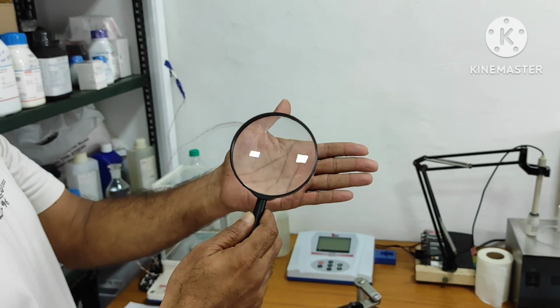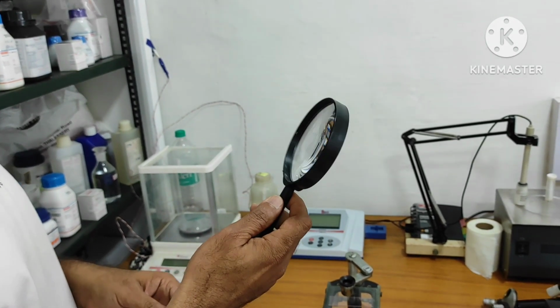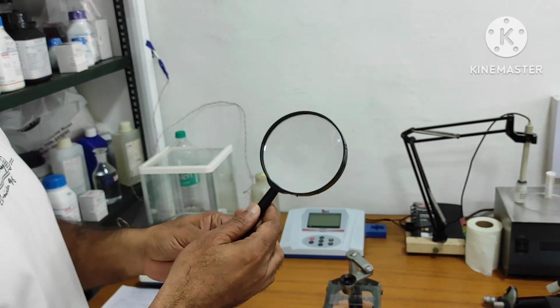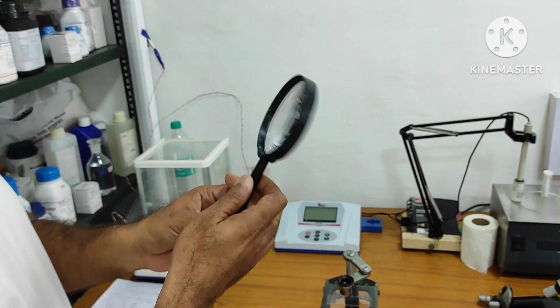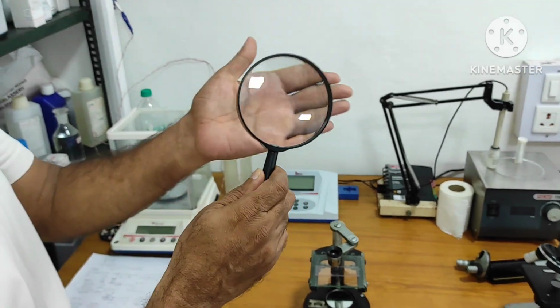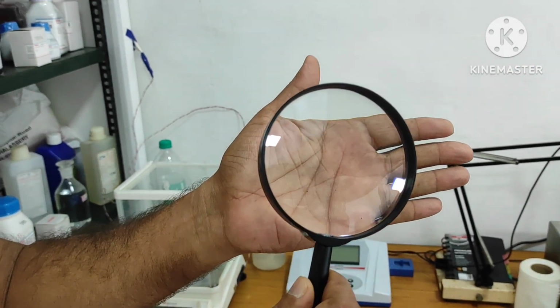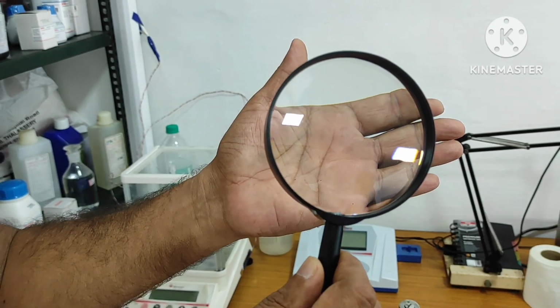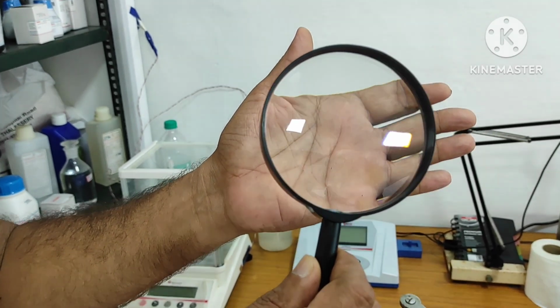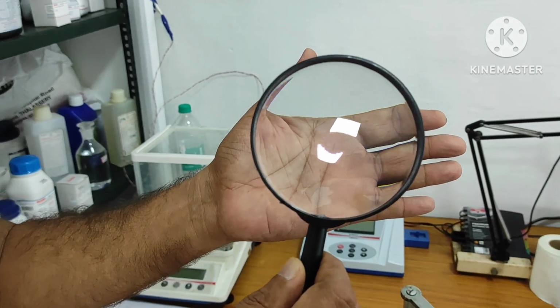Almost all houses and all schools have this kind of thing, also called a magnifying glass. It has one lens only, a single lens. In other words, this is the simplest kind of microscope, where an object can be enlarged a little bit to a certain extent, and here we can also say we can magnify.